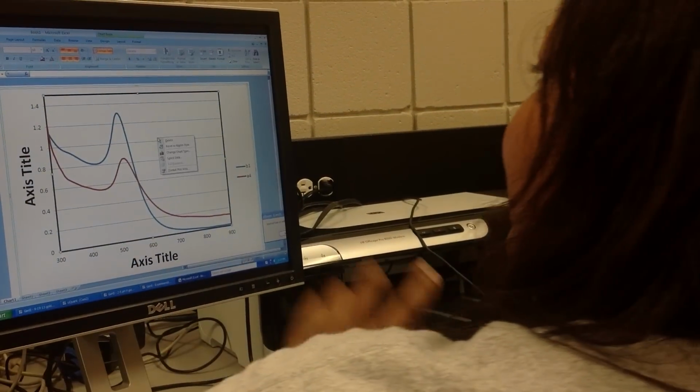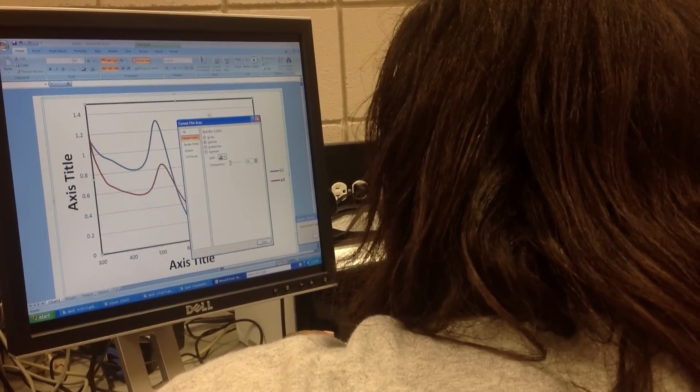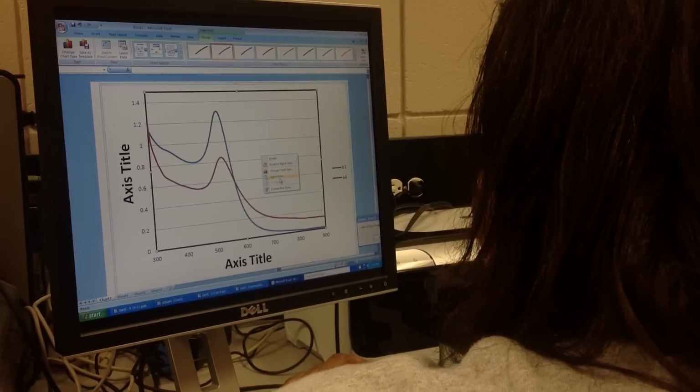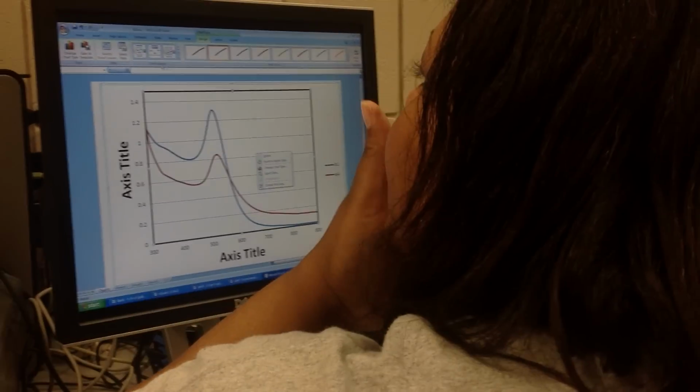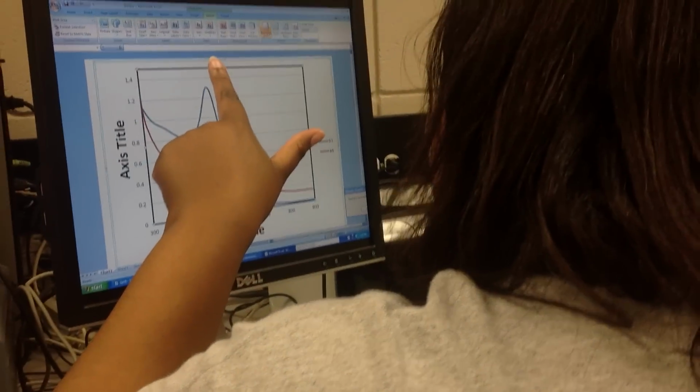So that's cool. We want to get these horizontal lines off. Format plot area again. Where is it? Fill. I just told you no fill. That's going to do your border. We'll figure that out at some point. That's the grid styling, I guess. Maybe a place up here to do our grids, plot area, grid lines. We don't want any grid lines on this chart. So now that's your template.